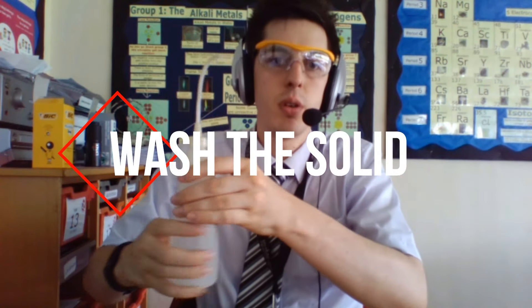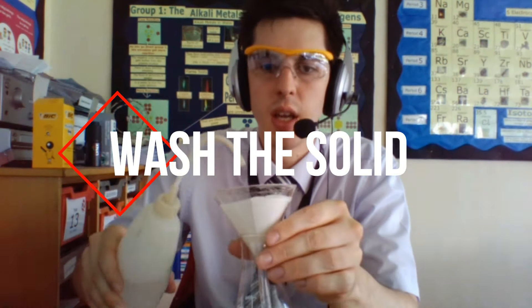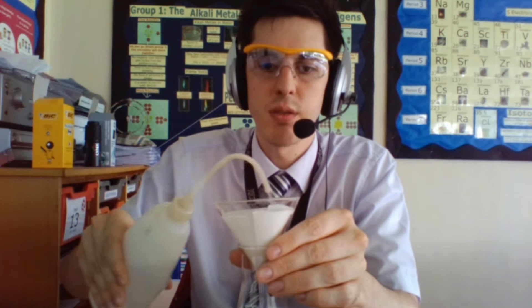So once you have done that, the next thing is to make sure it's pure. To do that you need to get yourself some more deionized water, distilled water, and just rinse it. That gets rid of any impurities, any sodium nitrate that might be left.